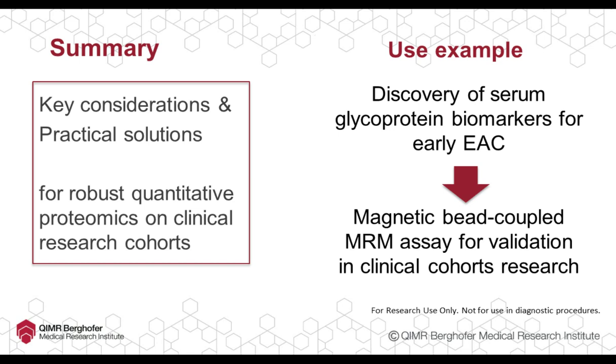So finally, it just remains for me to summarize what we went through today. So we considered the key aspects of variability in proteomic research using clinical cohorts and some practical solutions that could achieve robustness in the quantitative proteomics analysis of large clinical cohorts.